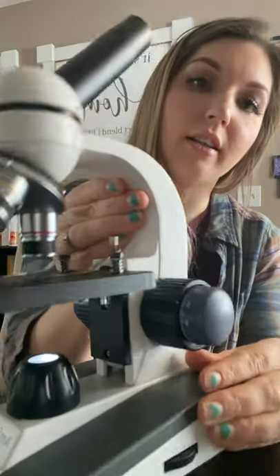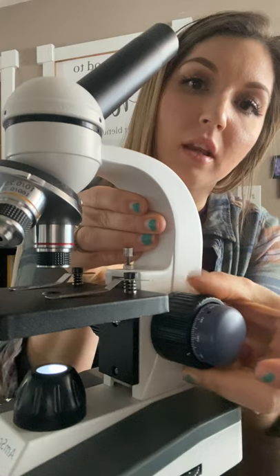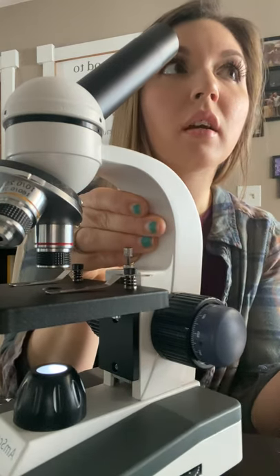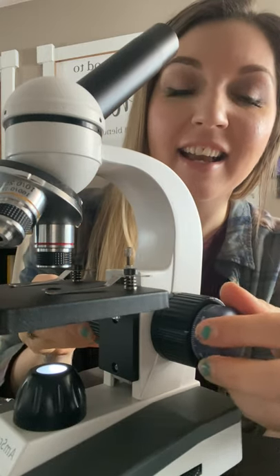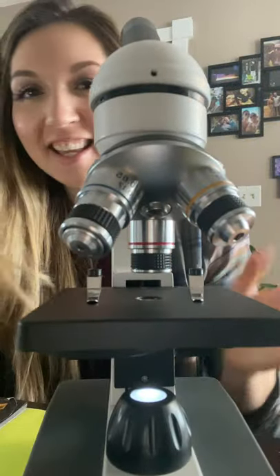These are the adjustment knobs. This is the coarse adjustment knob, which is going to bring it into focus on a larger scale, and then this is the fine adjustment knob to really fine-tune it.